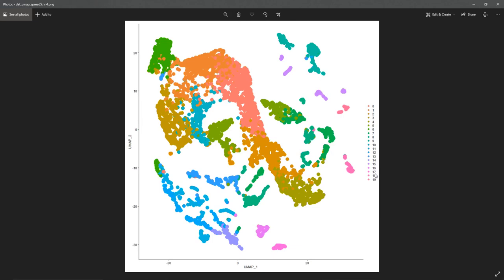Yet you could easily start waving a flag around saying you've identified novel cell types based on this graph. So you need to move that slider to find that balance between identifying what you know is there and perhaps just pushing the boundary a little bit to see is there anything else there. There's lots of subtlety to that.